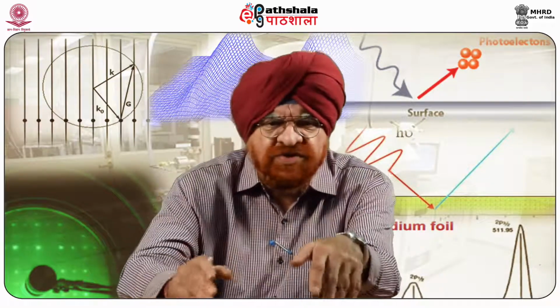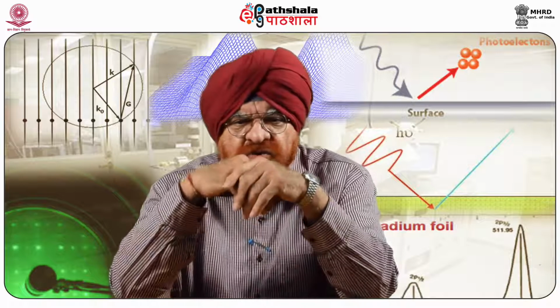On the other hand, the AFM can examine a field of view larger than 125 microns, that is 0.005 inches. This is done so that we can make comparisons with other information, for example features seen in the light microscope or hazes seen by eye.